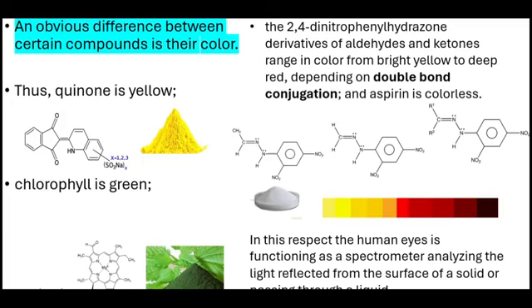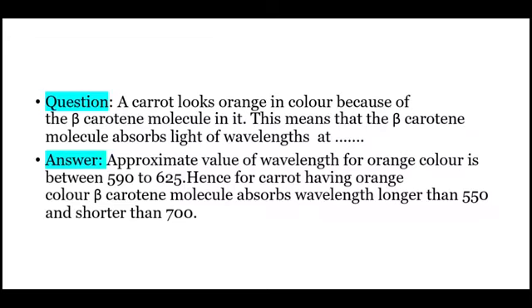In this respect, the human eye is functioning as a spectrometer, analyzing the light reflected from the surface of a solid or passing through a liquid.